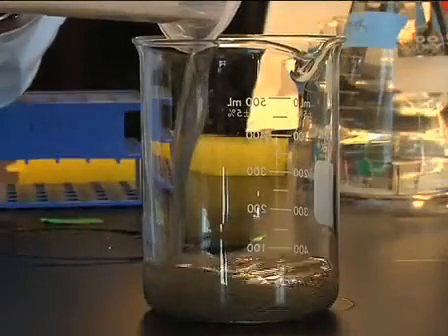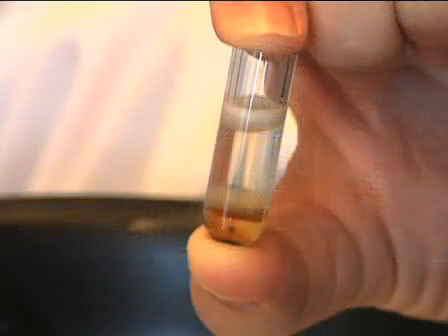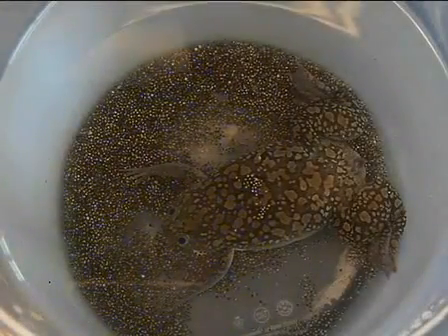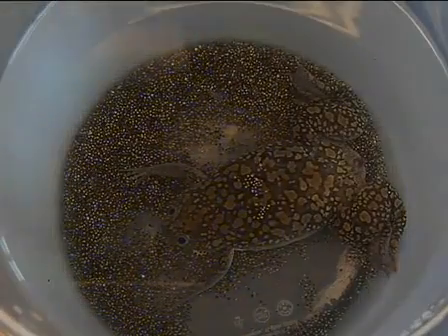Xenopus laevis egg extracts are useful as sources of cytoplasmic and organelle material for in vitro reconstitution of cellular events, such as nuclear assembly and nuclear protein import. Of course, before you can use egg extracts, you first need to obtain the eggs from female frogs.